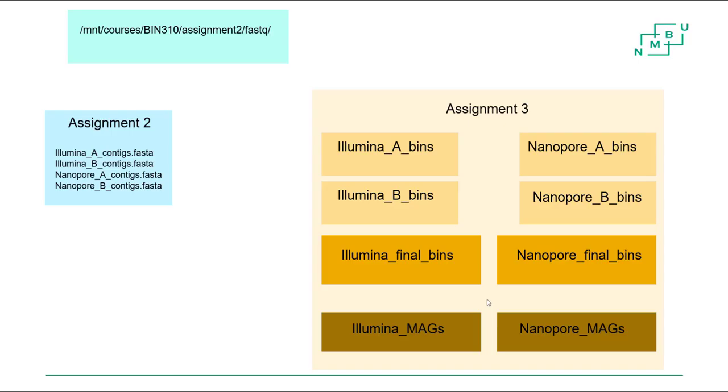You can do this in many ways, but at least this looks to me a little bit easier to overview, if you need some input for not messing up too much, because there are lots of files here now, right? 3 sets of bins here, a large number of FASTA files in each here, and of course it's not so large a number of files here, but still enough, and here it's not at all very much, but that varies from dataset to dataset.